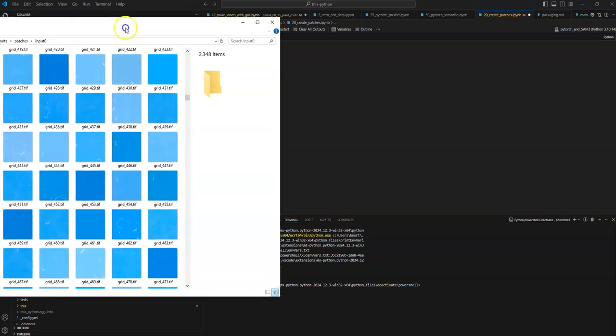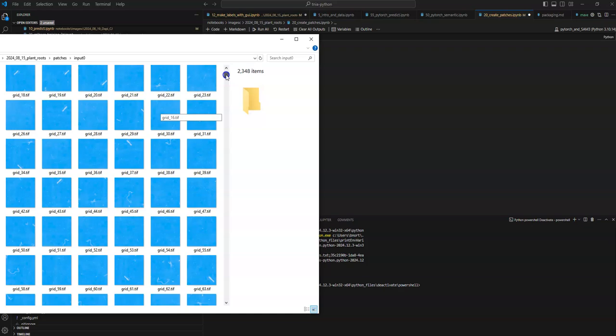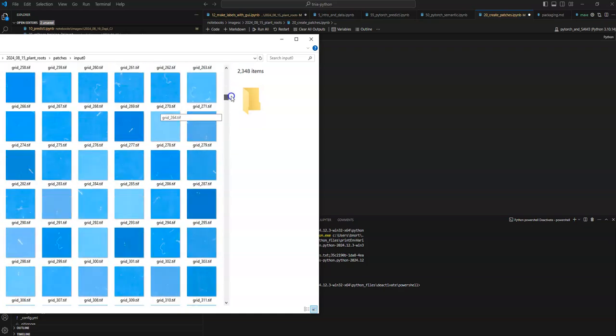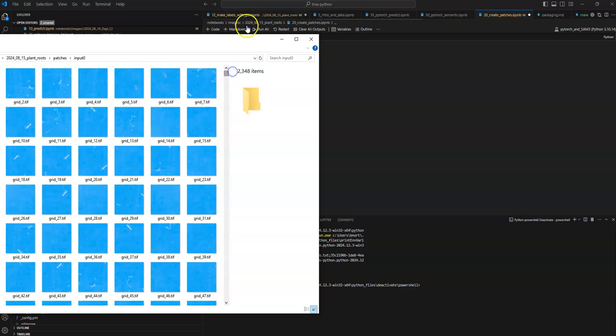One quick thing I should mention is that a lot of times this augmentation is sort of hidden from you. In a lot of neural network systems, it's done lazily, on the fly. I prefer to at least sometimes write the patches to disk and take a look at them, so I can diagnose problems, and then I can also reuse the patches for multiple different network types.